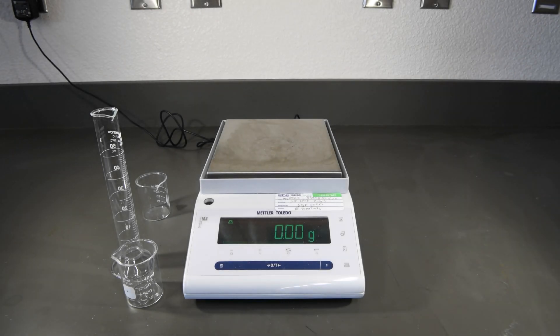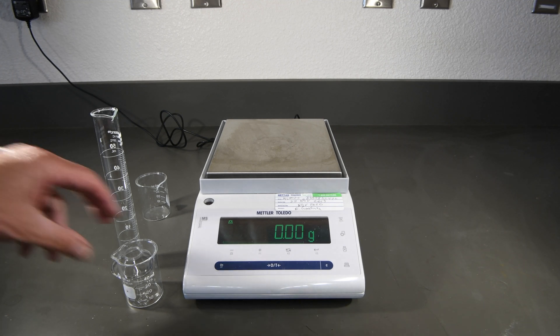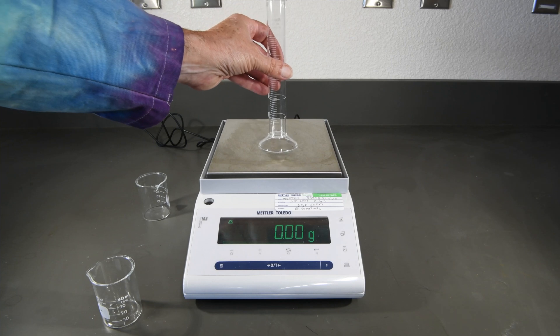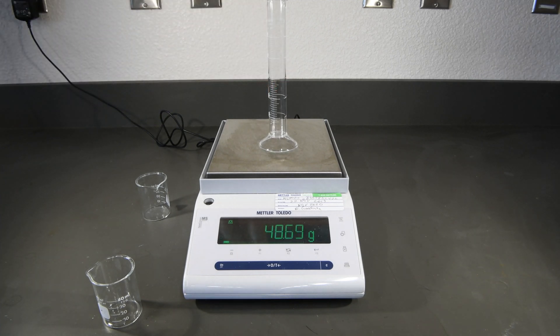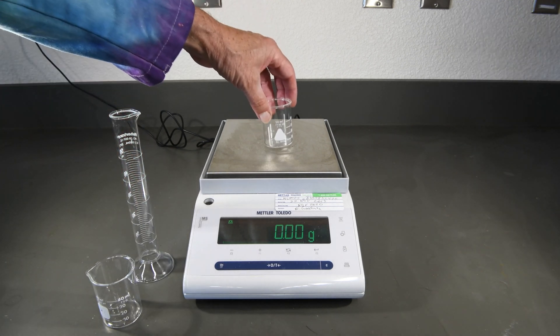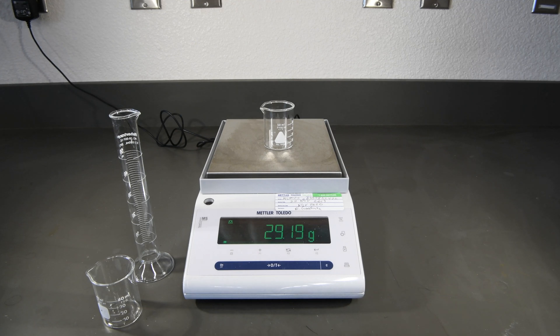Before we add the water to each of our containers, we need to get an initial mass. Let's start with the beaker that we're going to put the water directly into — that's going to be about 29.51 grams. Now let's measure the mass of the graduated cylinder — 48.68 grams. And finally, let's measure the mass of the beaker that we're going to collect the water sample from the burette — that appears to be about 29.18 grams. Now let's take these back and go ahead and add the water.